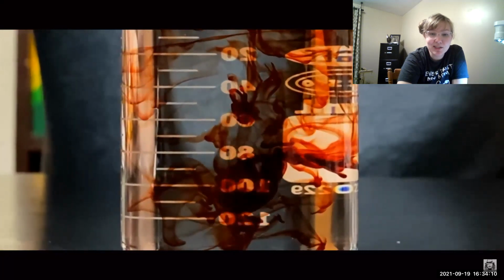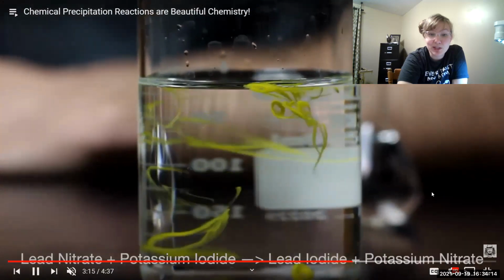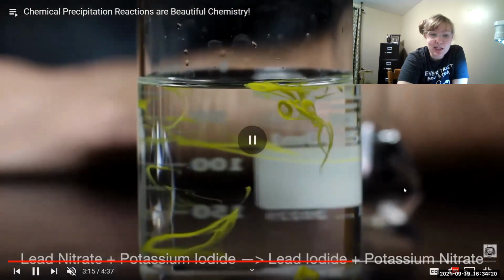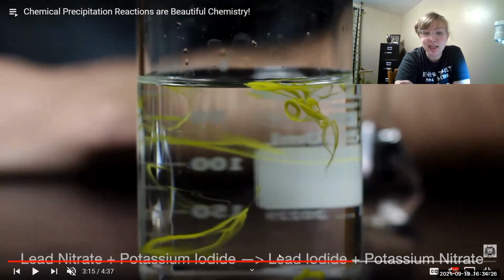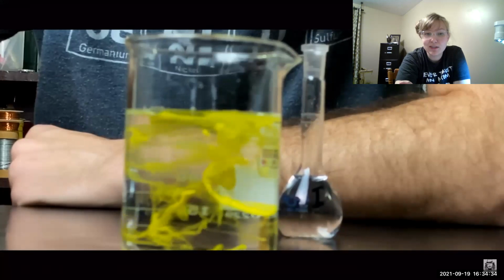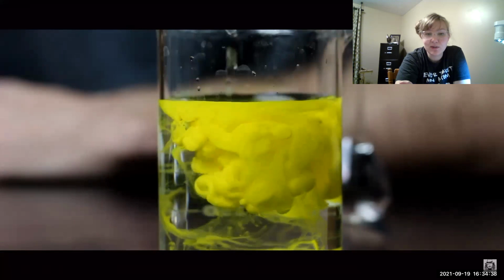So check that out. That's cool. I love it. Got any more? Wow, he just put it on all at once. Oh, that was too fast of an equation there, buddy. Lead nitrate plus potassium iodide is lead iodide and potassium nitrate. Lead iodide is the yellow. That looks so cool.